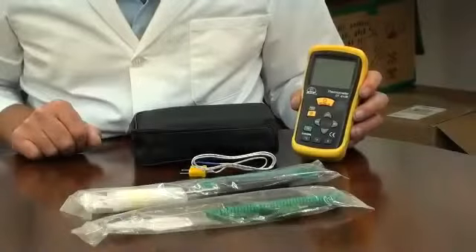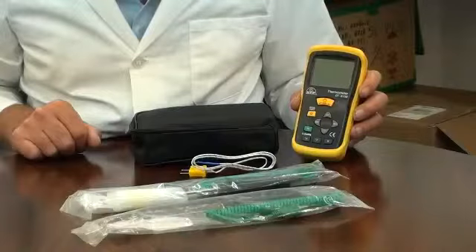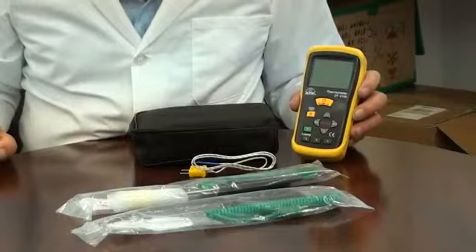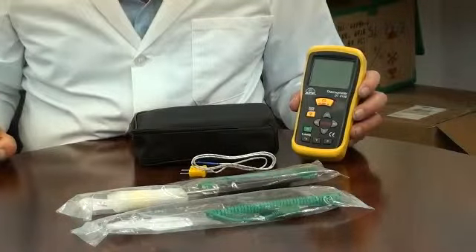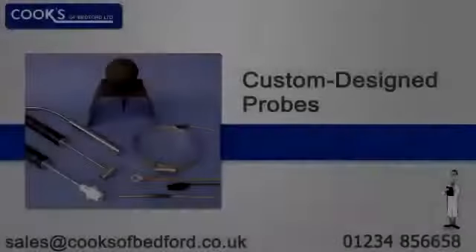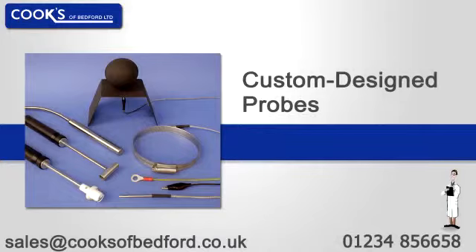This thermometer is ideal for many applications as we offer a range of interchangeable plug-in probes. These cover typical applications such as air, liquid, penetration, immersion and surface temperature measurements. If you have an application that requires a specially designed probe, then we can manufacture to your own specification.